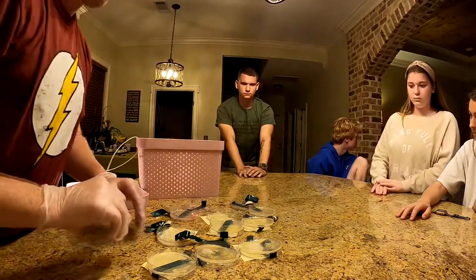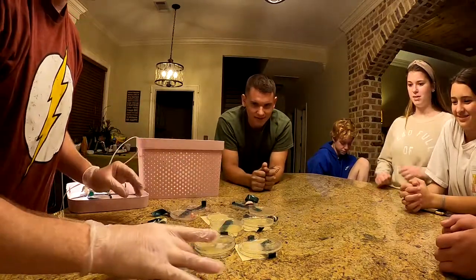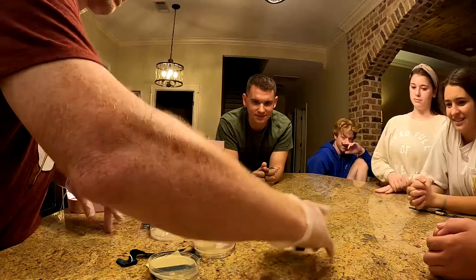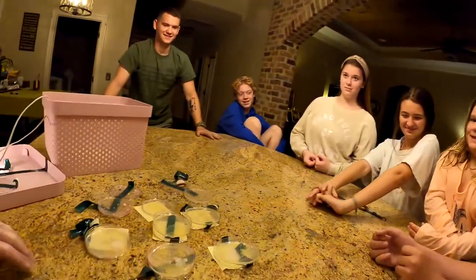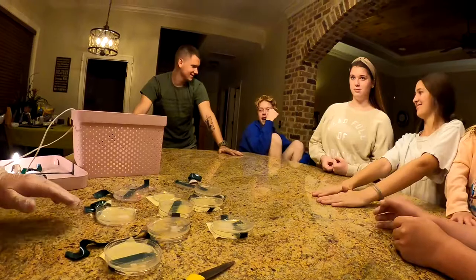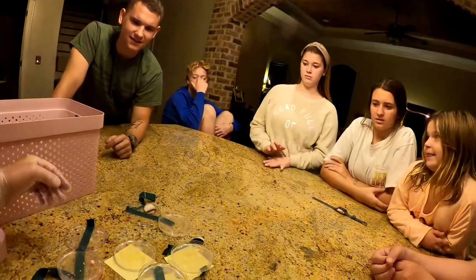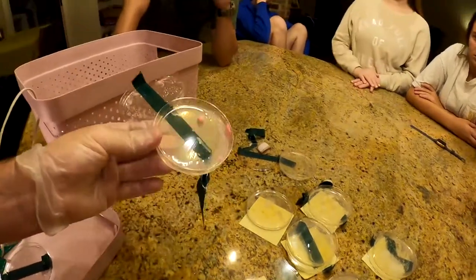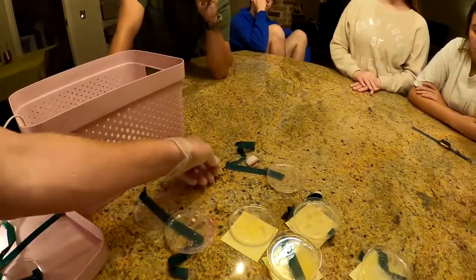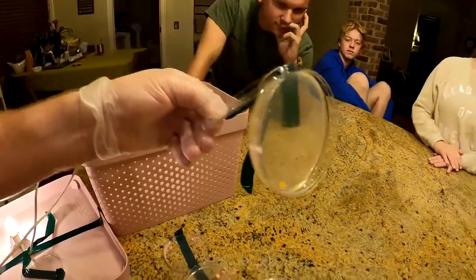Reviewing all dishes, the group agrees Kalen's Apple Watch is the worst. The cleanest sample, surprisingly, is the Benadryl — it had less bacterial growth than even the Band-Aid sample, which showed some nice bright orange bacteria.